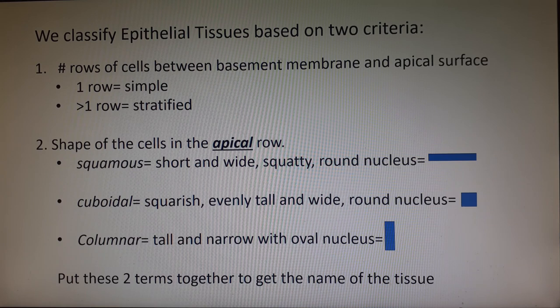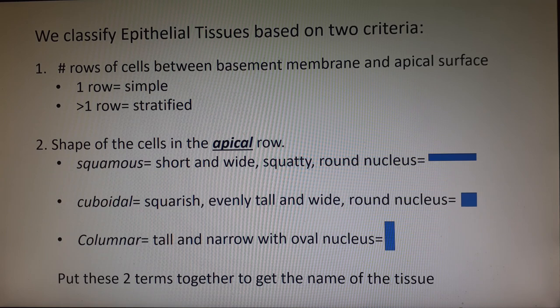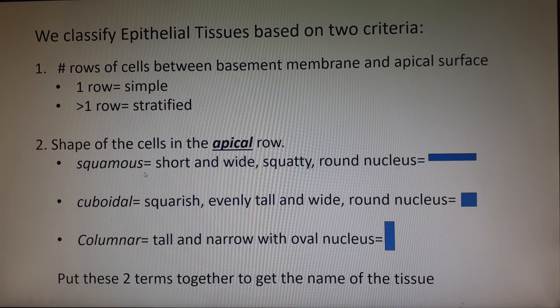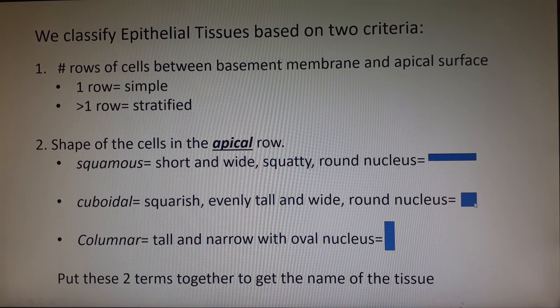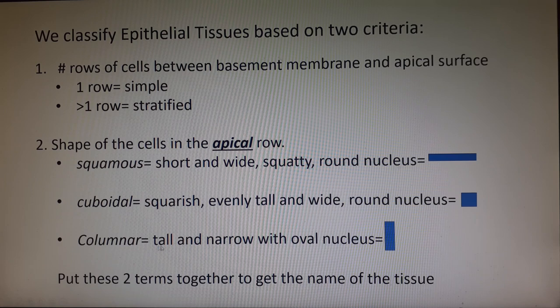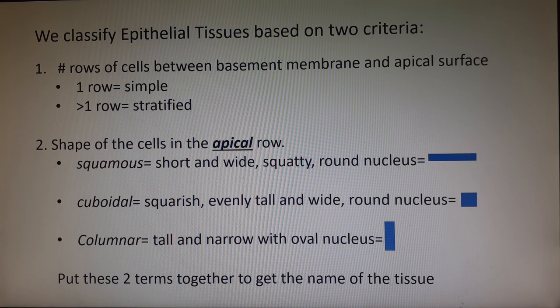If the cells on the top row are short and flat — squatty, with a round nucleus — we're going to call them squamous. You can say it either way; both are acceptable. If the cells are about as tall as they are wide, almost a squarish or cuboidal appearance, also with a very round nucleus, we say they are cuboidal — you can hear the word cube in there. And if instead of being flat or squarish they are tall and skinny like a column, we're going to call them columnar. You take these two criteria and you get the names of six of the eight epithelial tissues.